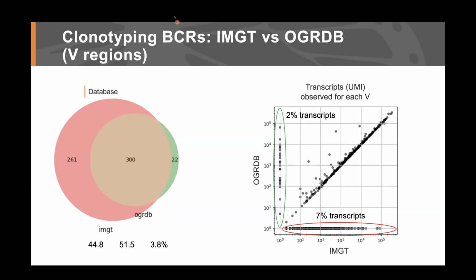This is something that we're all doing. But when you're conducting a comparison like this, I think that's an important thing to consider, because assignment is, in many ways, a loaded term. It's just the thing that the aligner told you, but that could mean many things.